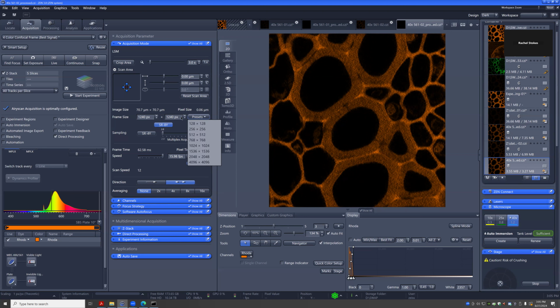The only limitation here is that on the regular area scan, you have very much free control over these pixel numbers. Let's see if we can mess around with this a bit. See if I go lower. Oh, okay. So it does have a minimum amount of pixels that it wants to do. This has to do with the amount of lines that it's scanning.